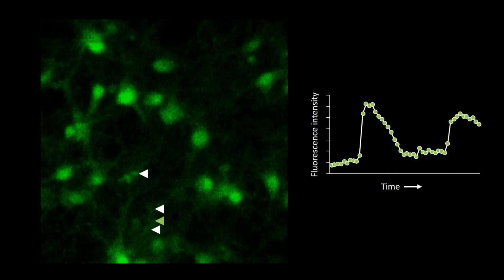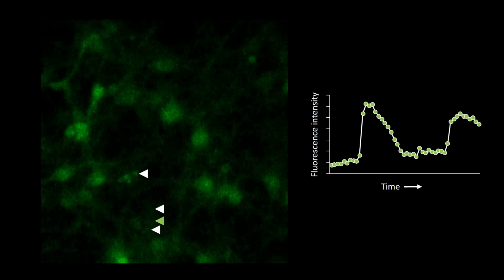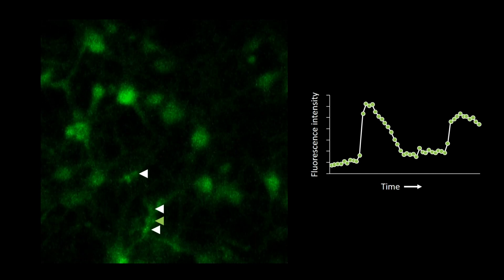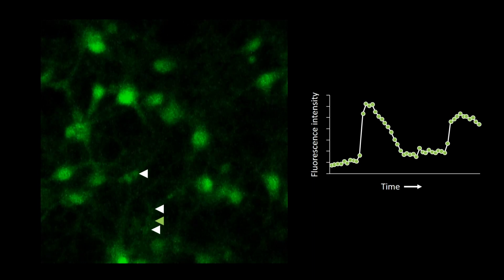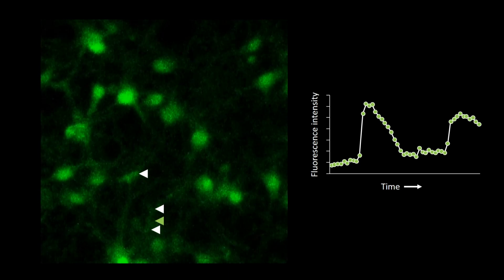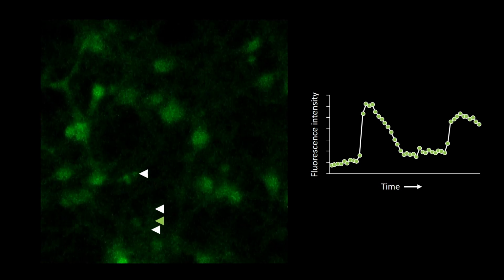Neuroscientists can use imaging software to place regions of interest over the synapses and measure the brightness of the dye during the experiment to study the timing and magnitude of the calcium responses. The graph on the right shows the quantification of the calcium signals in the synapse that's labelled with the green arrowhead. These experiments are really useful for studying the effects of drugs on calcium signalling, and for example, anti-epileptic drugs often target voltage-gated calcium channels.